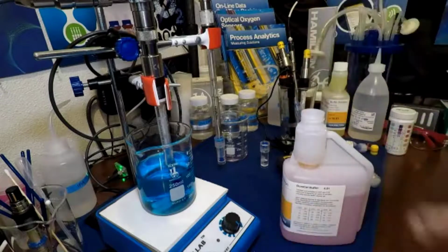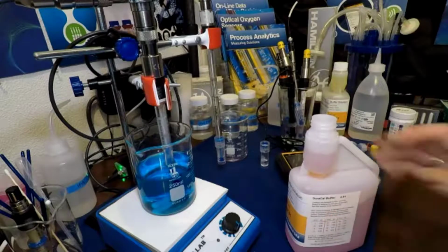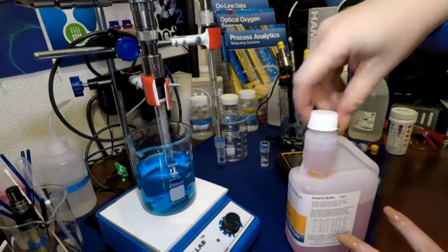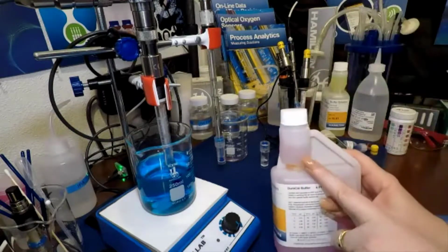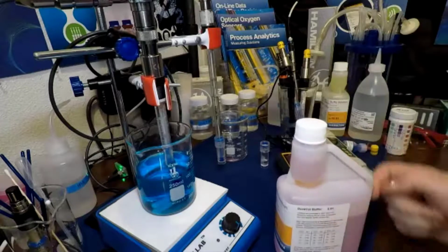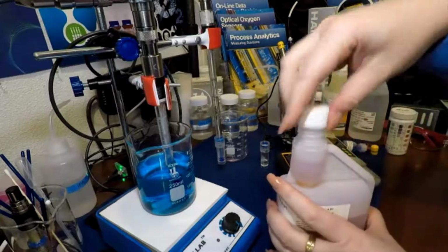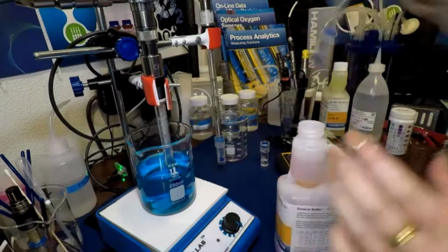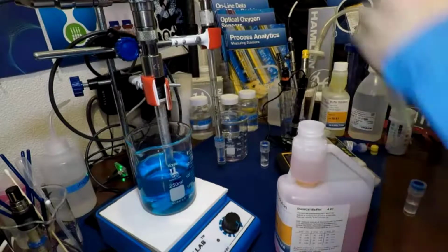In this case, the Hamilton ones are super easy to use because if you just squeeze, it fills a small amount of buffer into this cup. There's a valve in here that prevents it from going back in, and it only goes up one way. It doesn't come back. This means I have a handy way of measuring fresh buffer every time I need to measure.